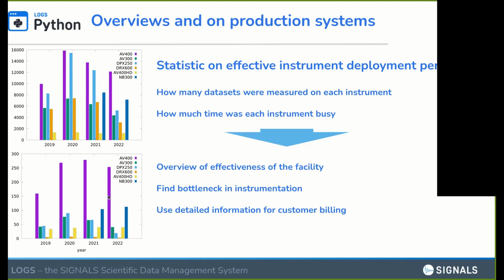So we also extracted another feature from logs, an acquisition parameter, which is the duration of the experiment. So, let's say, how effectively the machine was really used, or occupied by measurement. If you plot the usage of each machine over the years, you can see a different picture. Some of the instruments were used basically all the time. The reason is that they use a lot of automation on these instruments. Some others have a lot of measurements done on them, but the measurements were quite short, and they have a lot of standby mode over the years.